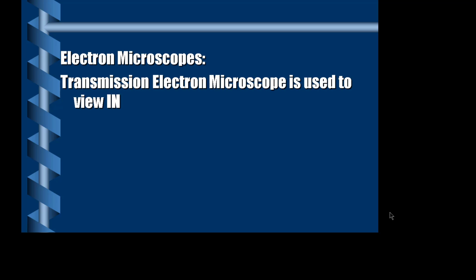So there's two main ones that we use in microbiology, and then there's a couple others I thought I would mention because they do have some significance to genetics and biology. So there's many different kinds of electron microscopes. These four are not the only ones, but I had to draw the line somewhere at what you should know, so I drew it here with four. The first one is actually the most powerful one of the four, and I'll let you write that before I explain.